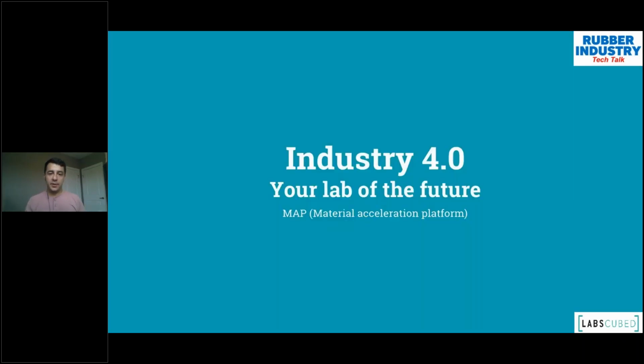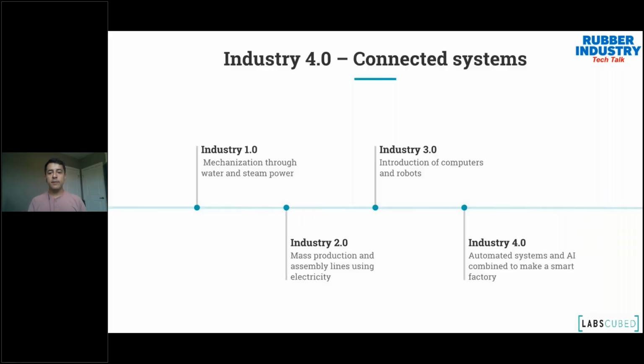So let's put it all together, which is Industry 4.0 or the lab of the future concept. Everyone thinks of Industry 4.0 as computers and robotics, but it really isn't. It's taking computers and robotics and giving them an intelligent layer, meaning they can make decisions. A quick example is a fully automated manufacturing plant that takes into account the humidity and temperature, and maybe final testing in the quality lab, to slightly change the mix or the ingredients going in, to keep getting really consistent, great output material. That's where you get to Industry 4.0.